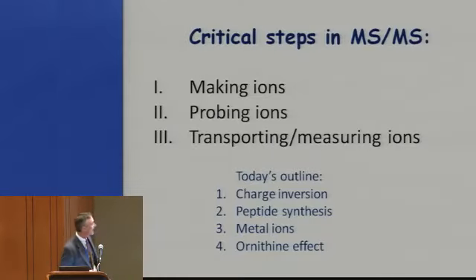So I just broke down some of the important components in an MSMS experiment: making ions, probing ions, which is where Sarah has really made a big impact and that's really where the focus of this talk is, and then transporting and measuring ions. So for people who are really focused on what happens inside a mass spectrometer, those are the opportunity areas.